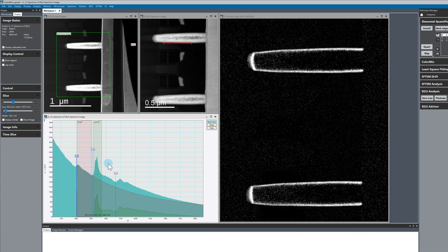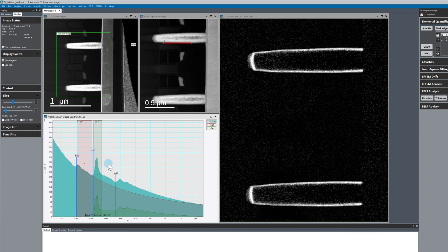You can see that the dynamic map tool is a really fast and easy way to rapidly get elemental maps and optimize those signal window positions and sizes for a given dataset.